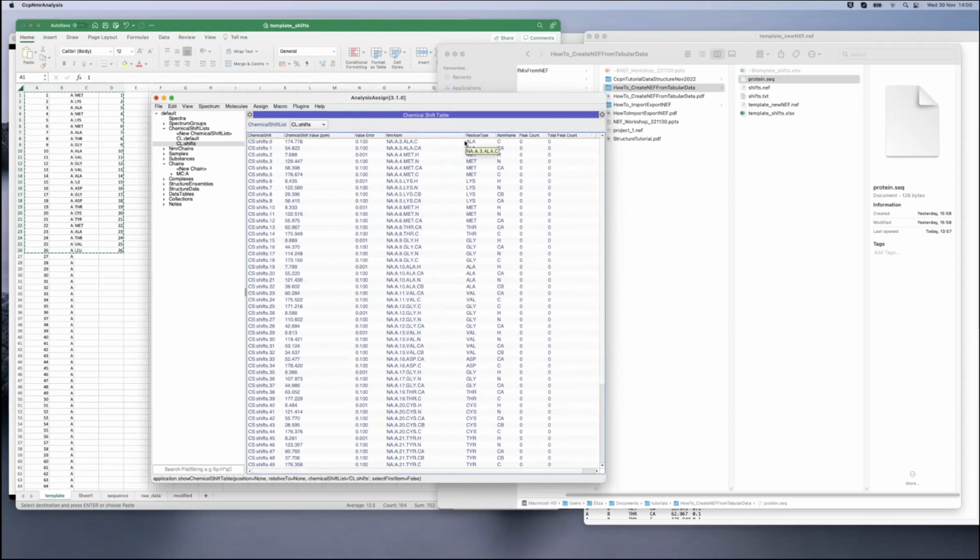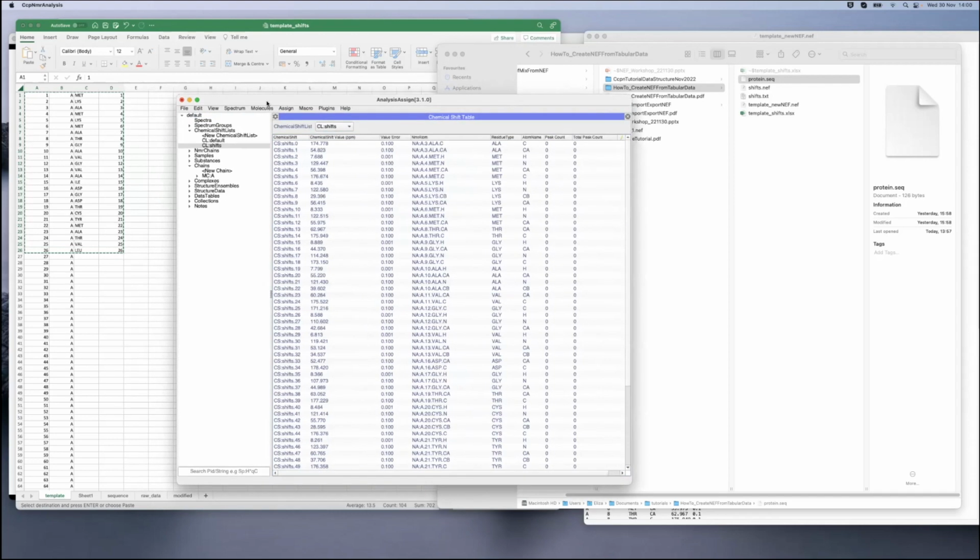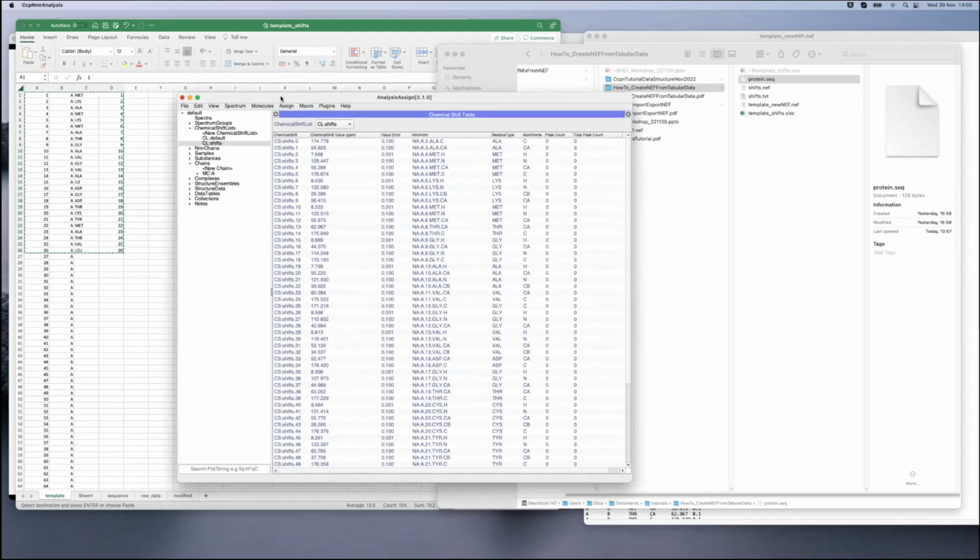So whatever NEF pipelines are not capable of doing for you, you can do with this simple way. You don't need obviously any programming experience for that, or a slightly scary command line. And you can have your shifts if you can divide it into columns. But as I said, and as I promised to Herten, I will emphasize, don't do it if you have any other option of not doing it.